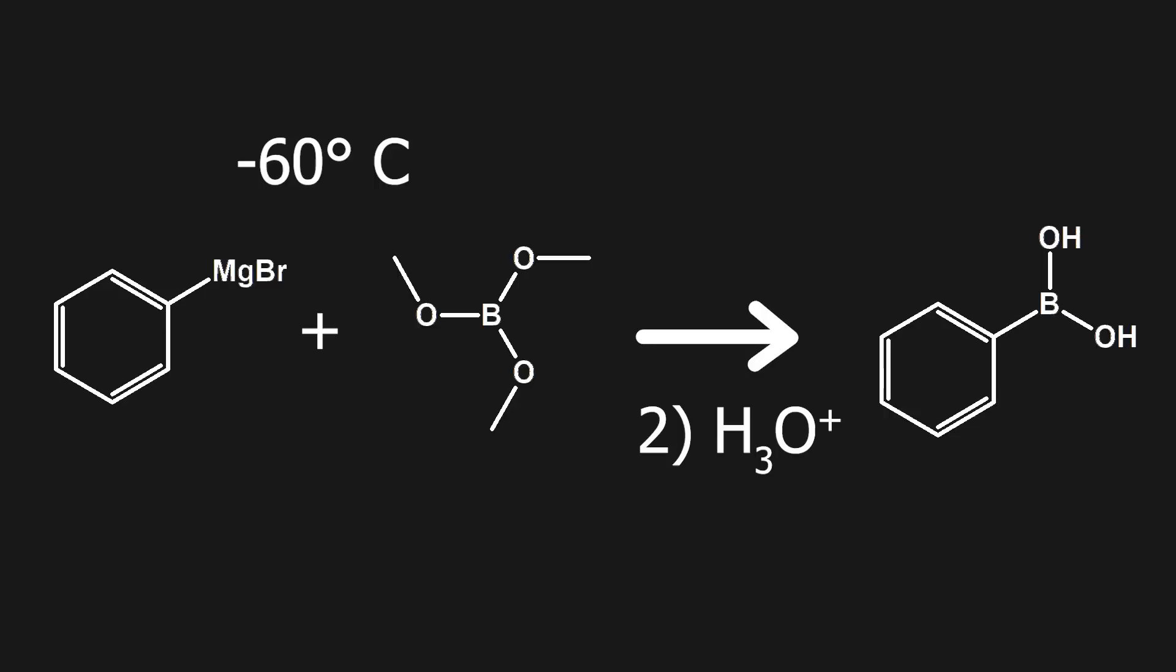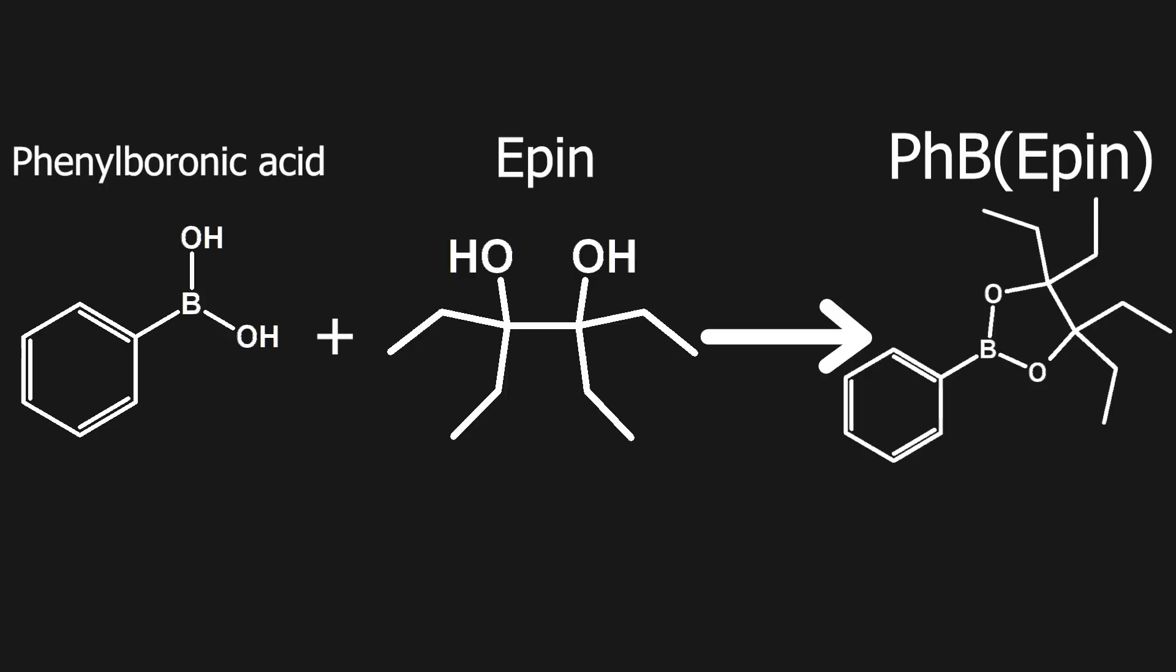With some workup, it can then be purified. And after that, I can continue with making the phenyl B-epin. Luckily, this reaction is very simple. And these reactants can simply be mixed in a 1-to-1 ratio in DCM.